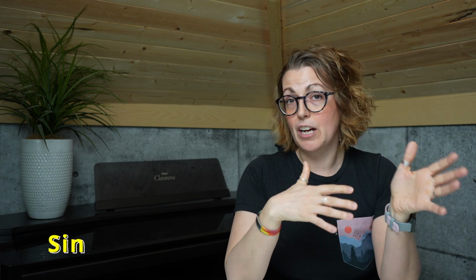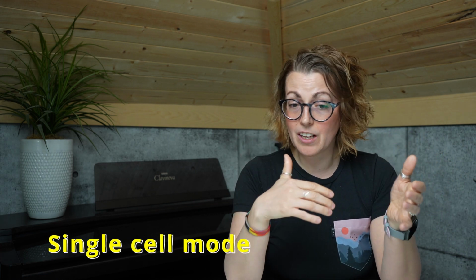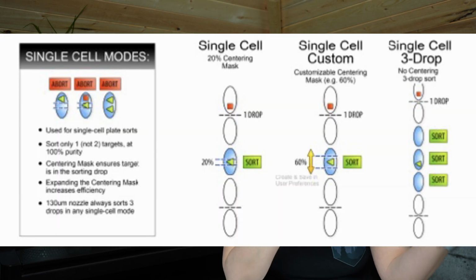And finally, single cell mode. This is really quite self-explanatory. It's looking to put a single cell into a well, generally of a 96 or 384 well plate. This is largely used for cloning purposes, and as you can see is highly selective for the droplet that will be sorted, because you really, in this case, want to ensure only one cell gets into those wells. This is a case where extreme purity is necessary, and because you're generally not capturing a lot of cells, the lower recovery is not an issue.